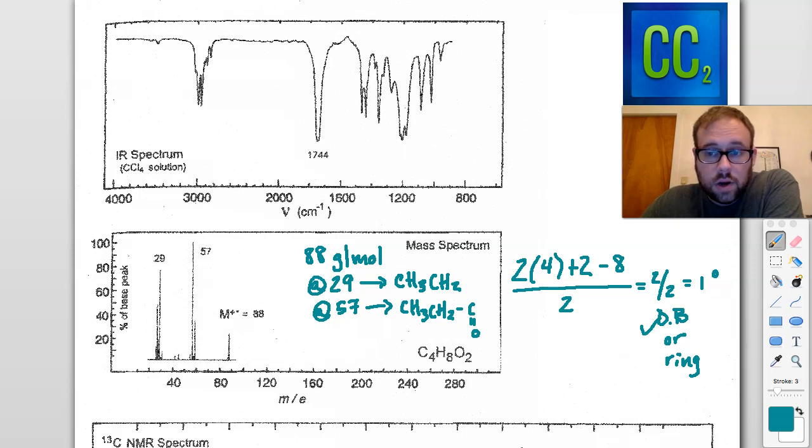So that's off to a good start. We probably have at least some portion of our structure here, but we need to continue forward to figure out the rest of it. And we do have two oxygens we have to account for, not just one. So next, we would head over to the IR.